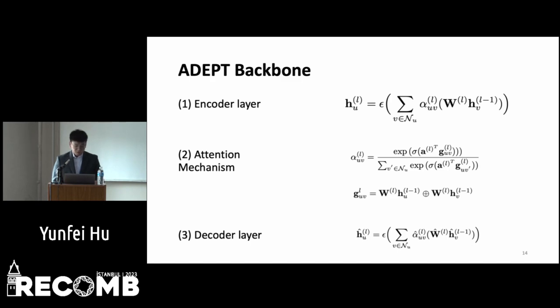As for the technical details here, the input for the encoder just consists of the normalized gene expression profile and the edge lists. And for each node, the encoder generates node embeddings by aggregating information from all neighbors based on this equation 1 here. And we denote H_u^0 as the normalized expression feature of spot u. And by treating expression profiles as the initial spot embedding here, the Lth encoder layer generates the embedding of spot u in layer L as follows. So basically, it's just what the equation 1 describes here. And alpha_uv^L is the attention coefficient, which is gonna be acquired through the second and third equation of the attention mechanism. And N_u just denotes all the neighbors of node u, including u itself. So this means we're just adding the self loops for each spot or each node.